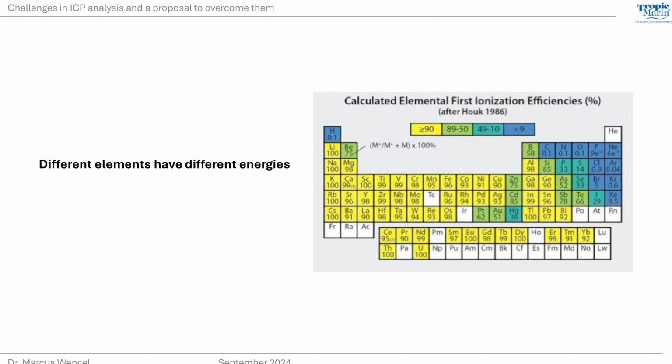And we see, if we watch the periodic system, on this right part, only 10% or a little bit higher of these elements are able to be measured in the system, right? So 90% we are not able to measure in the whole matrix. So things like fluoride, bromide, it's not easy to measure in ICP analysis because their energies are not high enough to get ionized.